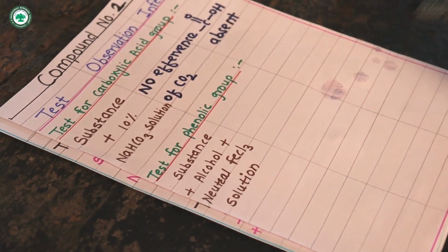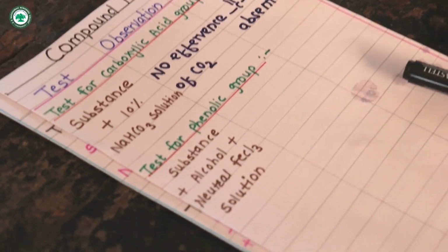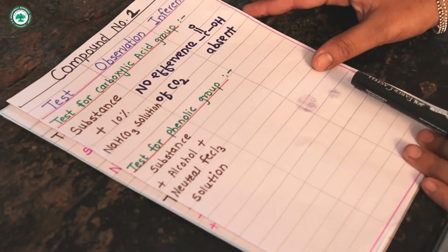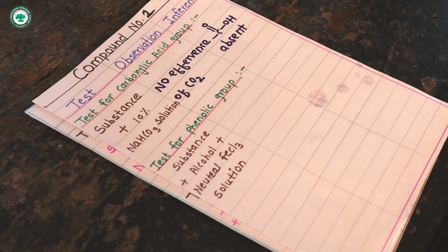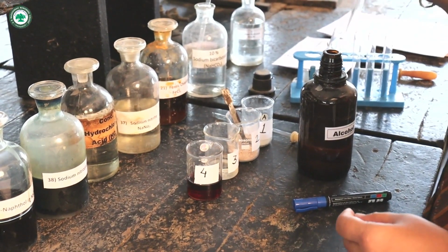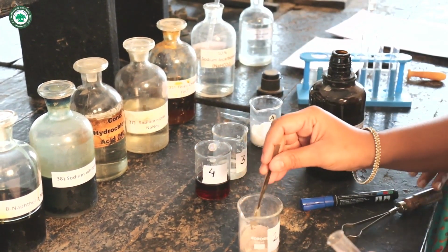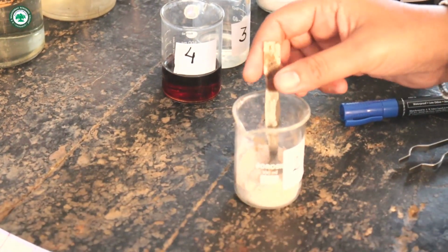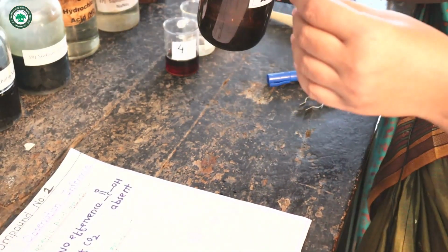Test for phenol is substance plus alcohol plus neutral FeCl3 solution. If there is violet, green or red color appearing, then and then only the phenolic group is present. Again, in a clean and dry test tube, take a small amount of compound second. Then add a little alcohol.